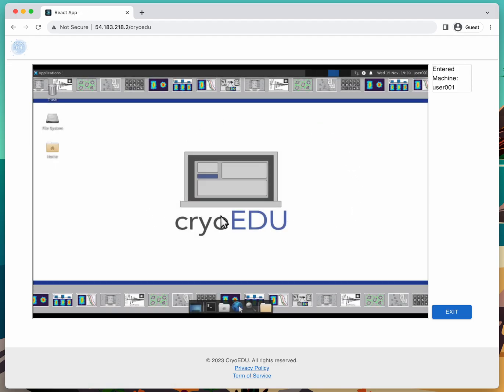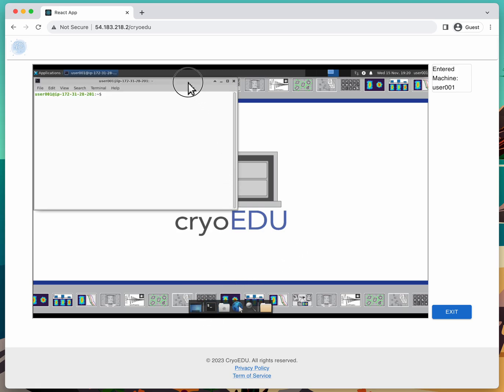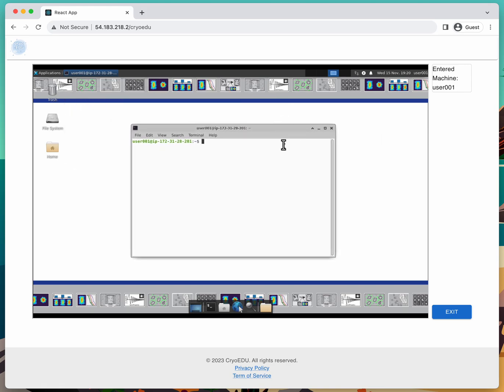So here is a remote desktop that's running Linux. And so for us, what we need to do is set up a directory that we're going to open the Relion simulator. So to do that, we are going to open terminal. And so here you can see a terminal. This is Linux, so if you type certain commands, you'll be able to see different outputs. So if I type ls, this will list a directory, and you see that I'm dropped off in my home directory where I have these different folders here.